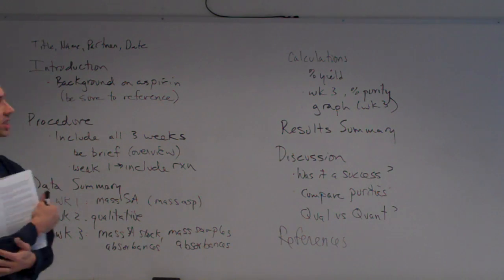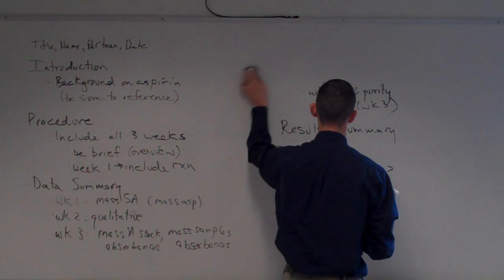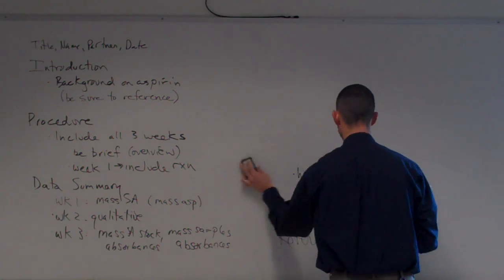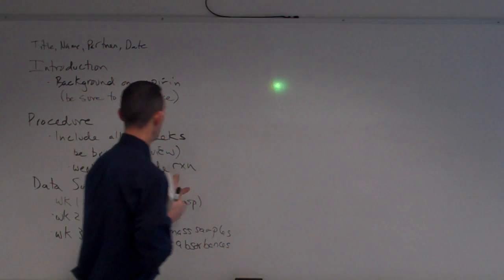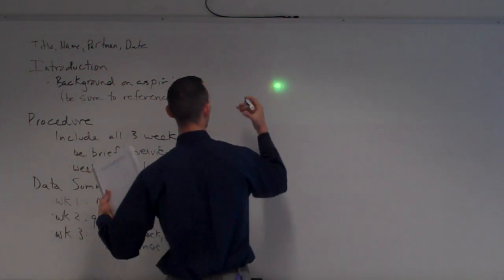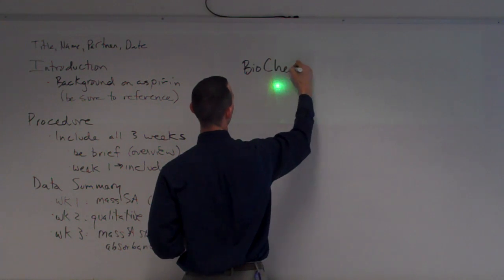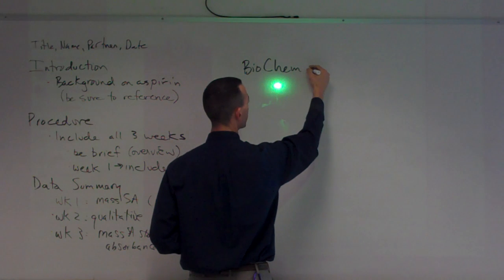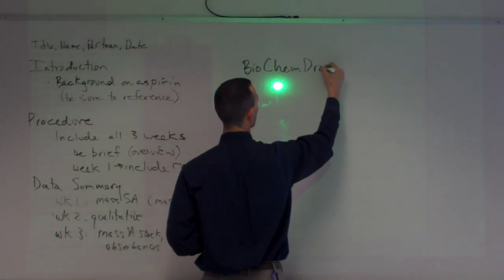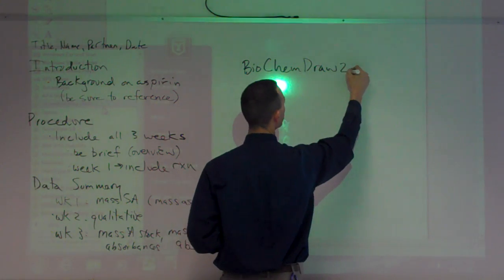All right, let's pull the projector back up and look at the ChemDraw program real briefly, which can help you write your reaction in. So we're using ChemDraw, although the program on our lab computers is called BioChemDraw 2010, I think, or 2012.